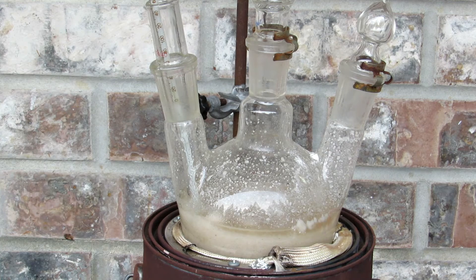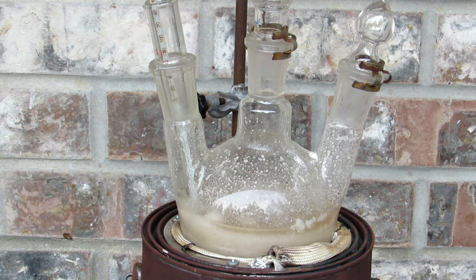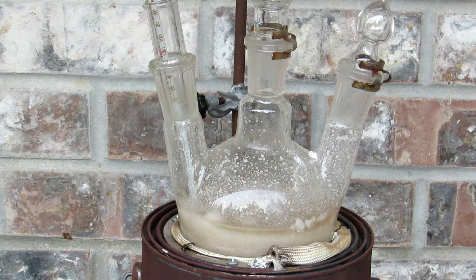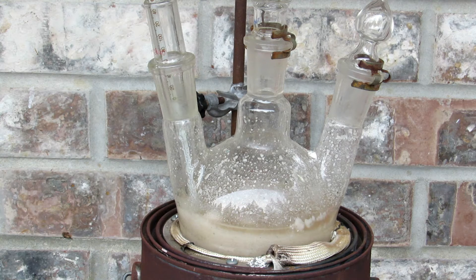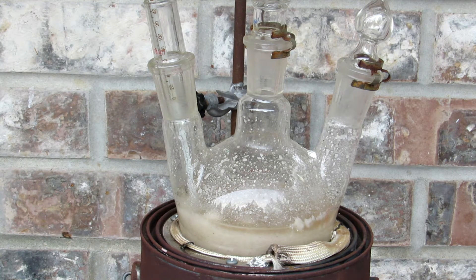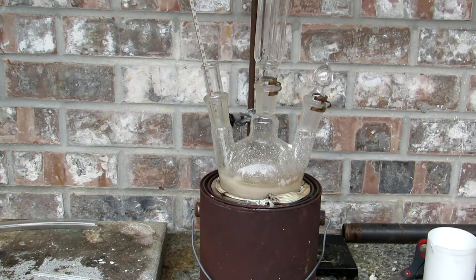After drying, the urea was crushed and added to a three-neck round-bottom flask. A thermometer was added in the side arm to measure the temperature, and then 210 milliliters of glacial acetic acid was added. I used a homemade heating mantle, which I showed how to make in a previous video. It only cost a couple of dollars to make and can reach up to 500 degrees Celsius.